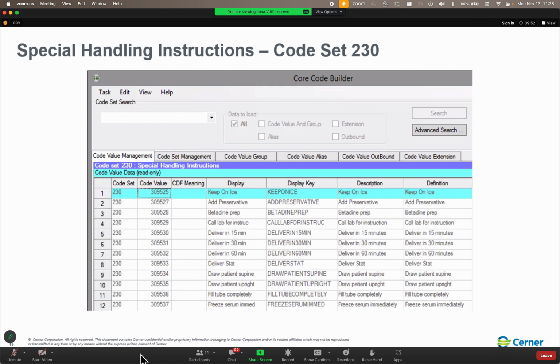So what that means is that we have to get this number to 12 characters. And right now it's got 13, assuming I'm counting correctly. So what would happen is we would truncate off the 1.